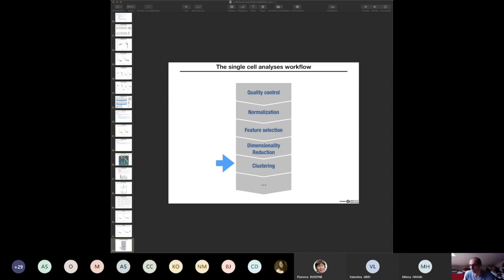It's true that when you choose the number of highly variable genes, I don't think it's a good thing to keep all 50,000 genes, because I don't know of a given cell type that will express that many genes of the genome. But you can choose a different threshold for the number of genes you select as highly variable. Here I chose 2,000.